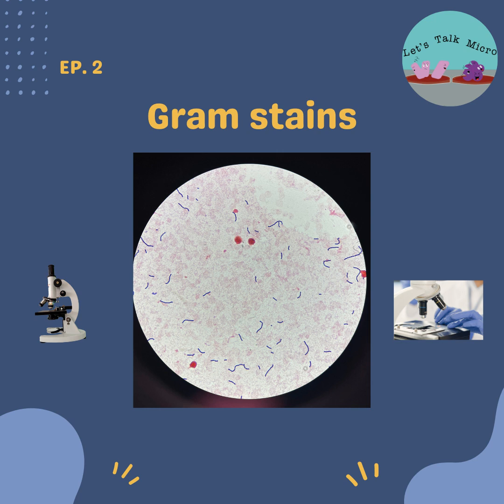Whereas the gram-negative bacteria, their cell walls are actually thinner. They just have a single peptidoglycan layer. So when the first dye goes through, the bacteria do not retain it. And they end up retaining your counterstain, which is your safranin, and that's pink.